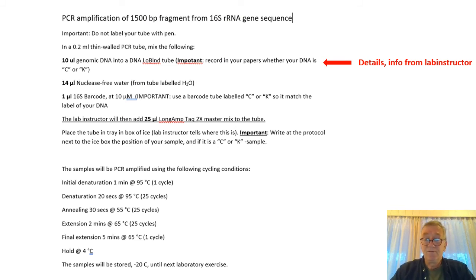PCR, of course, you should know in detail what is happening in PCR. We have talked about it in the lecture. This temperature shifting program will make sure that, even if you have very little DNA in the start, you have amplified your gene or your fragment or your part of the genome as you have chosen.